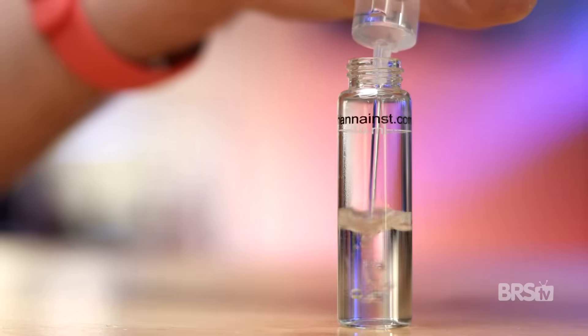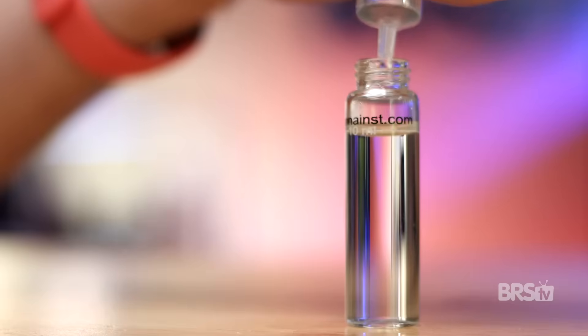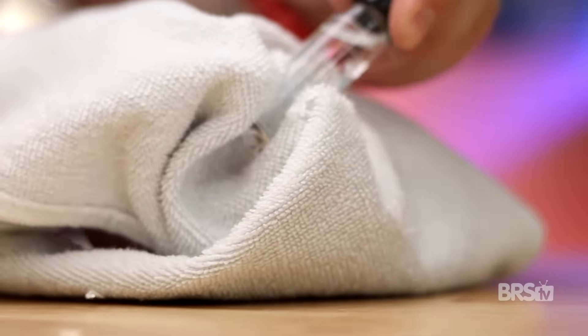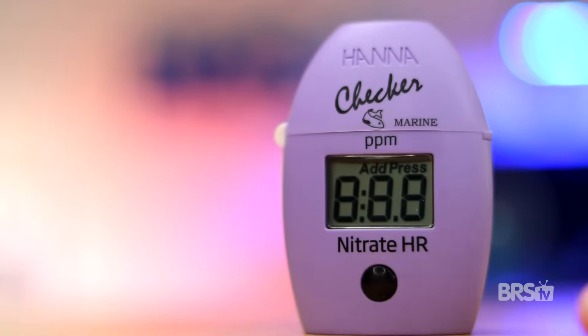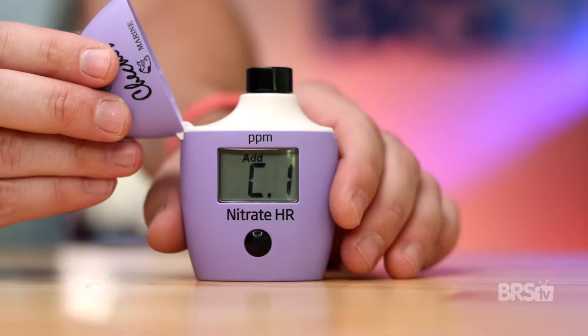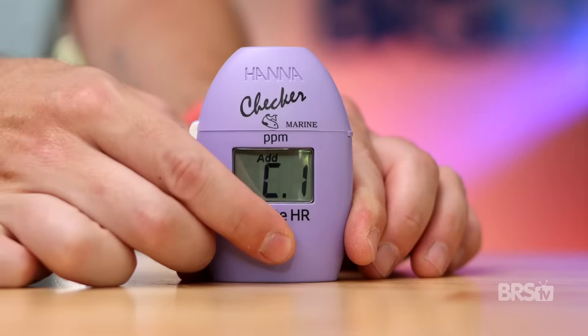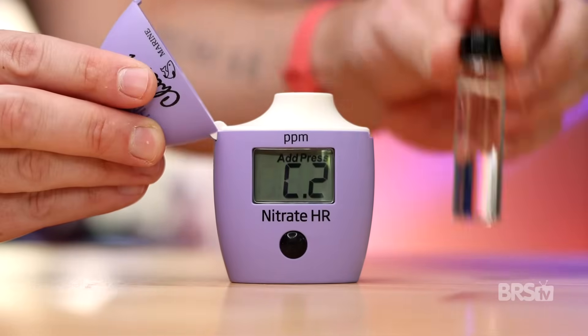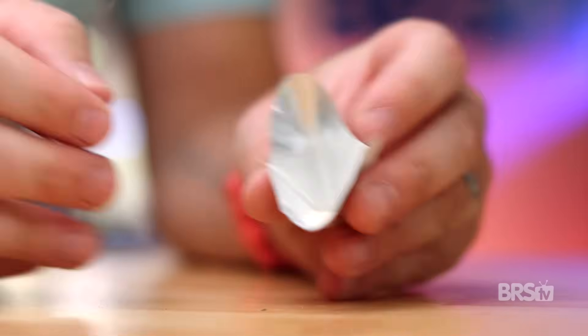Since this test kit only uses one reagent, it's super simple, and here's how you do it. Start by filling a cuvette with tank water up to the 10-milliliter mark. Screw the cap on and wipe down the outside with a clean towel. Turn on the checker by pressing the button and wait until it reads C1. Slide the cuvette into the checker, secure the top, and press the button. Once the display reads C2, remove the cuvette and add one packet of reagent.